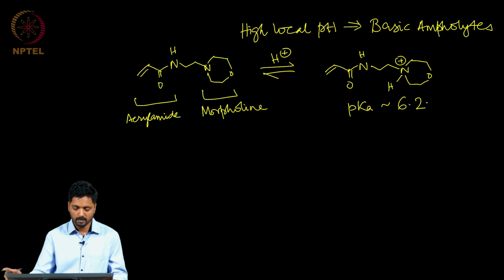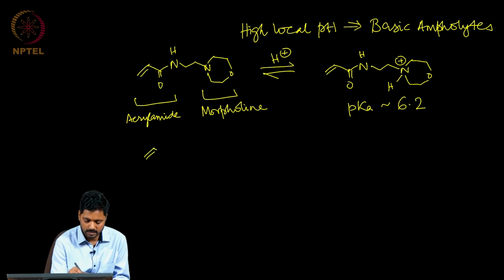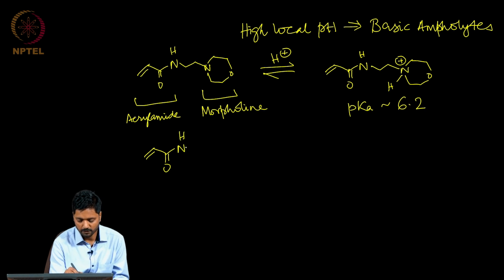So, in the same vein we can use a molecule which has the dimethylamino residue.